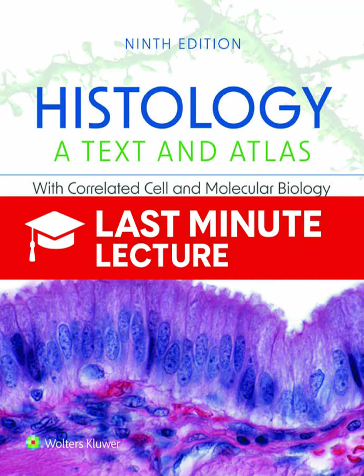It sounds like a complex journey, but understanding how these images are made is completely essential. It is, because if you're looking at a micrograph, you have to remember that every single image, it doesn't matter if it's a standard slide or some fancy electron micrograph, is a two-dimensional slice. And you have to mentally rebuild the 3D reality from that 2D image. That's the skill. You have to learn to interpret that slice and mentally reconstruct how it fits back into the original three-dimensional biological structure. Okay, let's unpack this whole process.